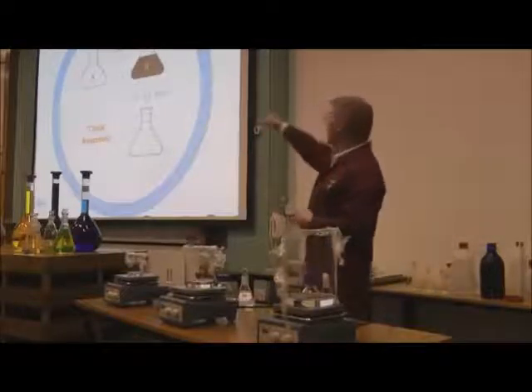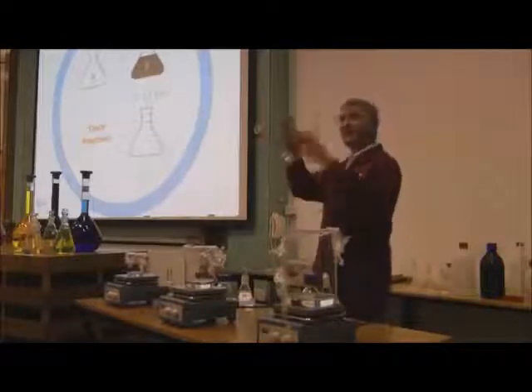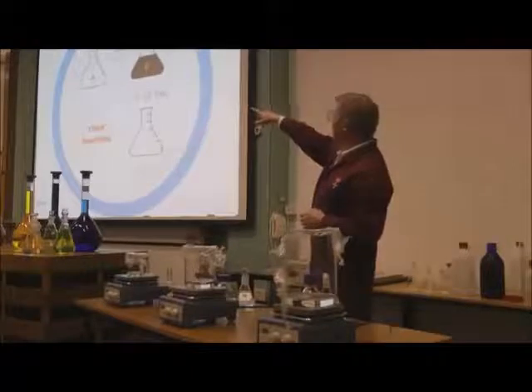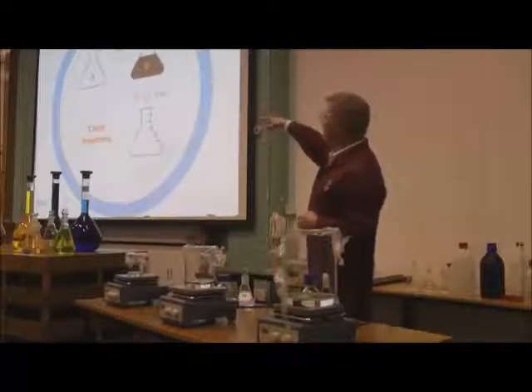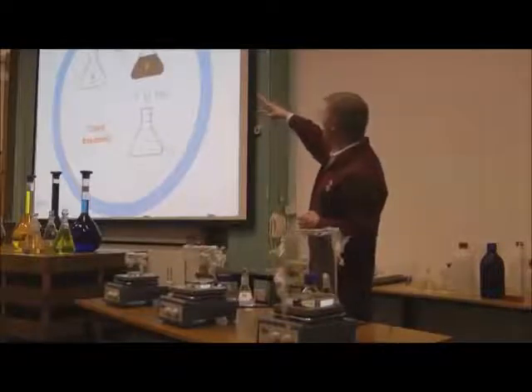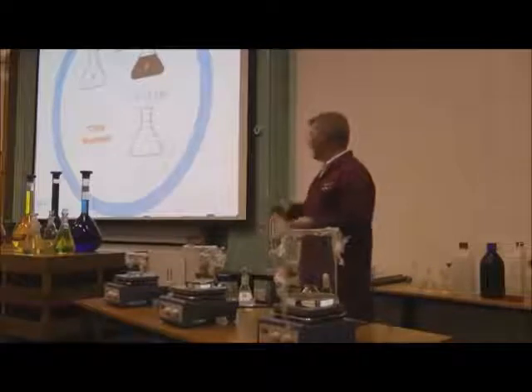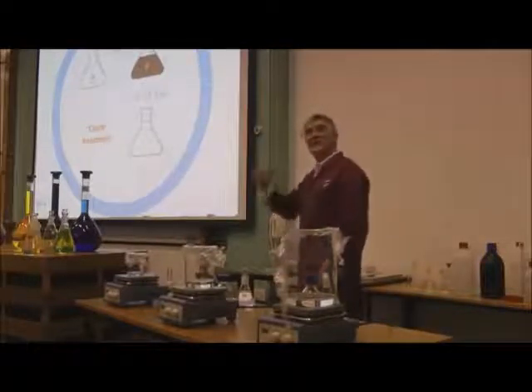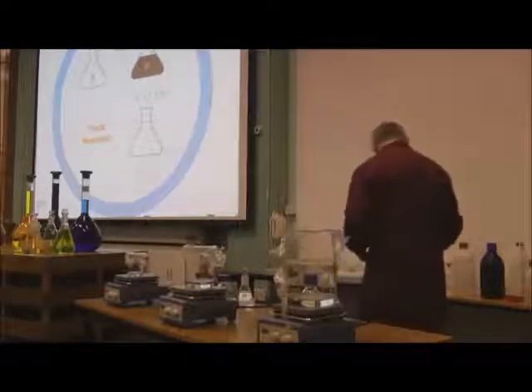Okay? So if we had 100 atoms of A and 10 atoms of C in this mixture, we would go, like, for the first 10 molecules, I've said atoms, molecules is much better word. 10 molecules of A goes through, reacts with C, we don't see any colour, because it's reacted into non-clear. As soon as the 11th molecule comes around, we begin to see the colour again. And that's what's causing this delay. So I want to play with that a bit more.